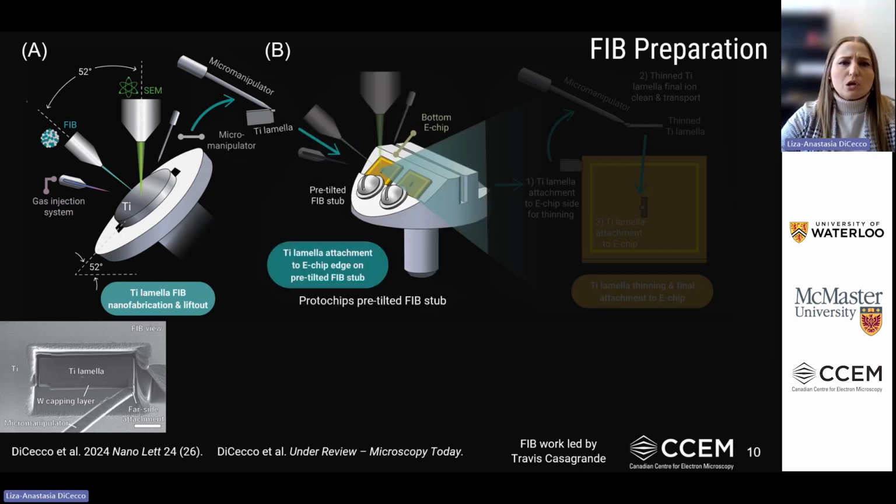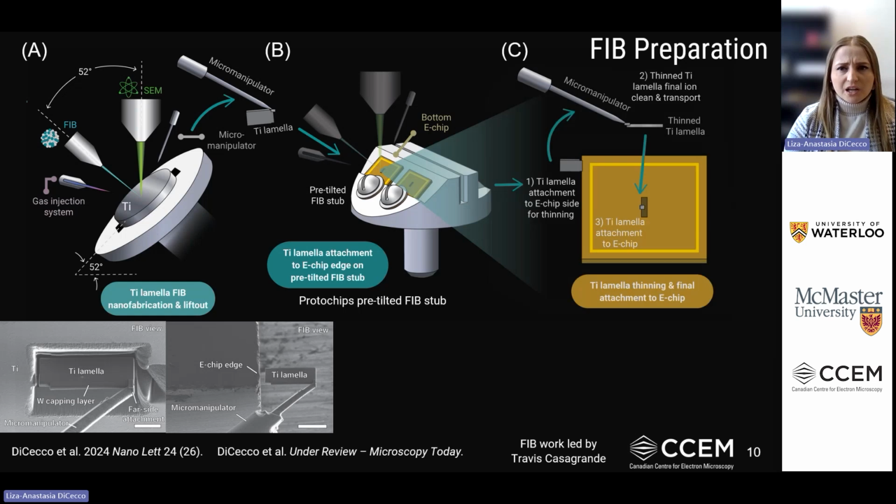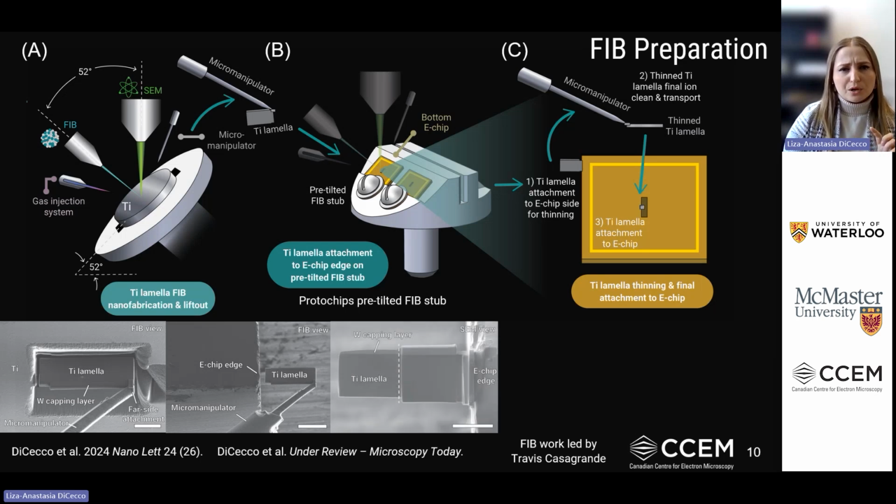Now, in this work, we are using the Protochips pre-tilted stub, and that helped with the workflows and with very delicately handling the E-chips as well. And so we removed the lamella and attached it to the side of the E-chip for our polishing directly. And then we did detach it. This is showing that process. We detached it once it was near the final polishing stages.